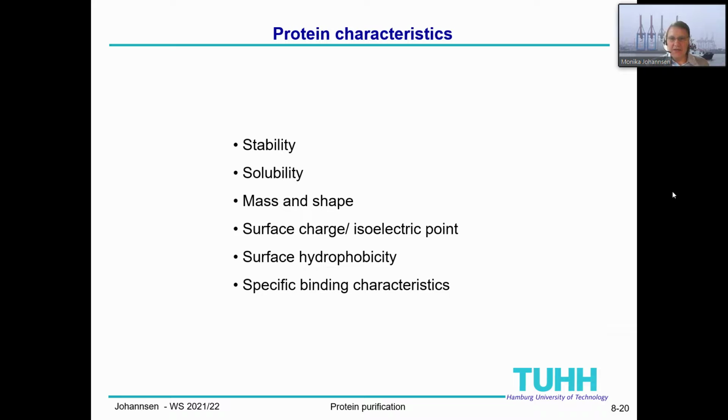Okay, so as Lening already said, we have to look at the different protein characteristics: the stability, solubility, the mass and shape of the proteins, the surface charge, the surface hydrophobicity, and there might be some specific binding characteristics. Regarding the stability, this cannot be used for separation, of course, but we always have to take care of it.